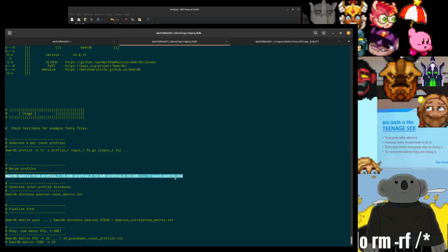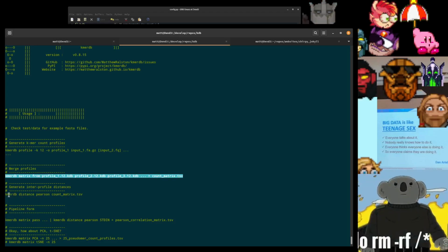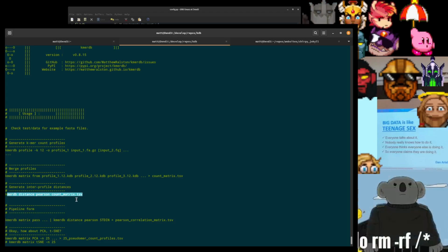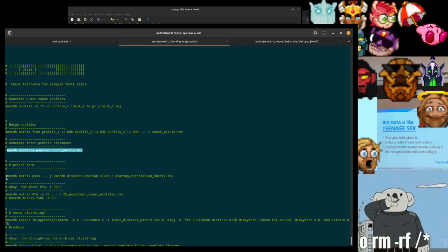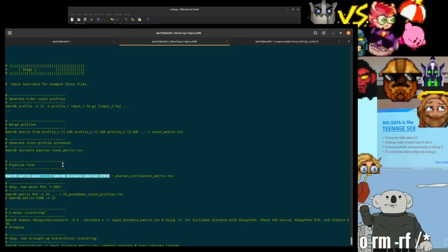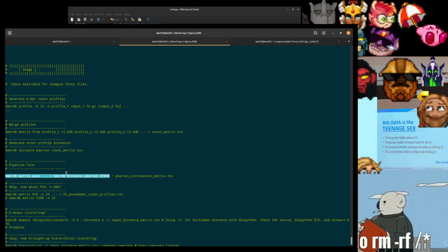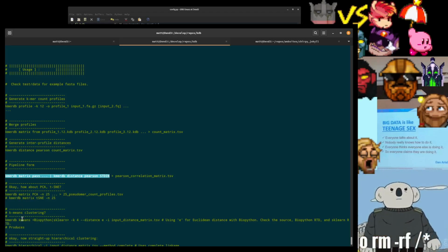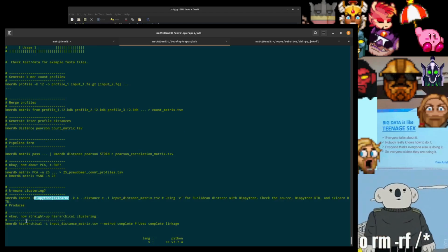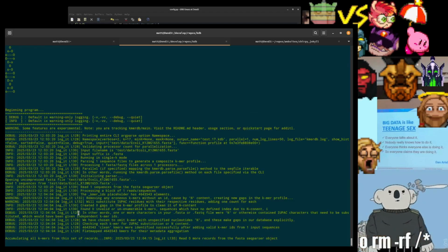This is how to collate count vectors into a count matrix. This is that Pearson correlation coefficient that we saw. And similarly, this is running these two steps as a single piped command. There's also k-means clustering with BioPython or scikit-learn, and hierarchical clustering, as well as t-SNE and some other stuff.